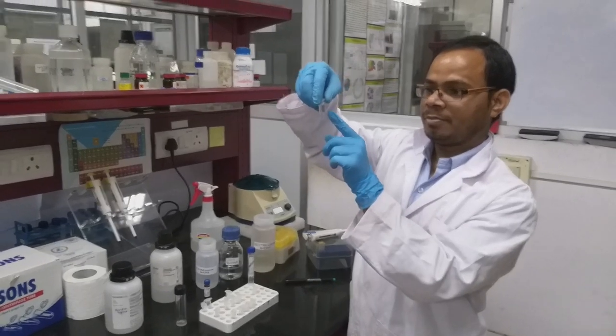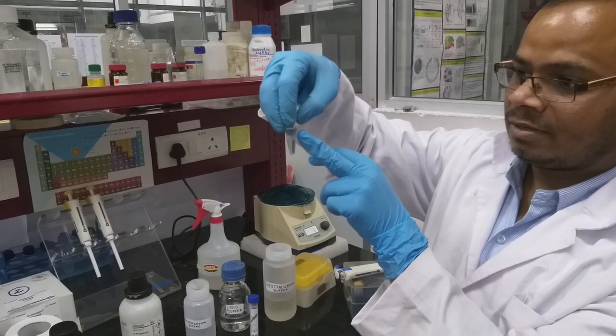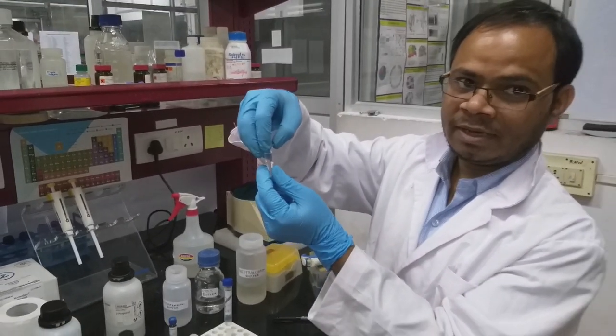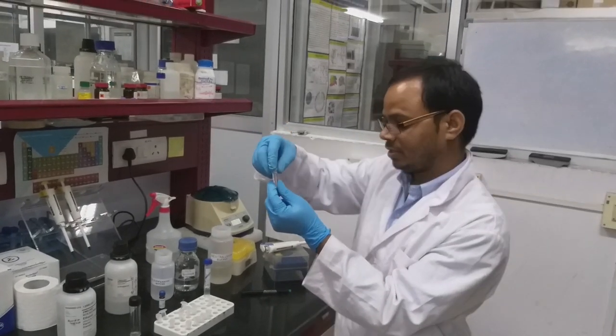We can see white precipitate in the solution. Now we have to centrifuge it, collect the white precipitate and wash with the 70% ethanol.